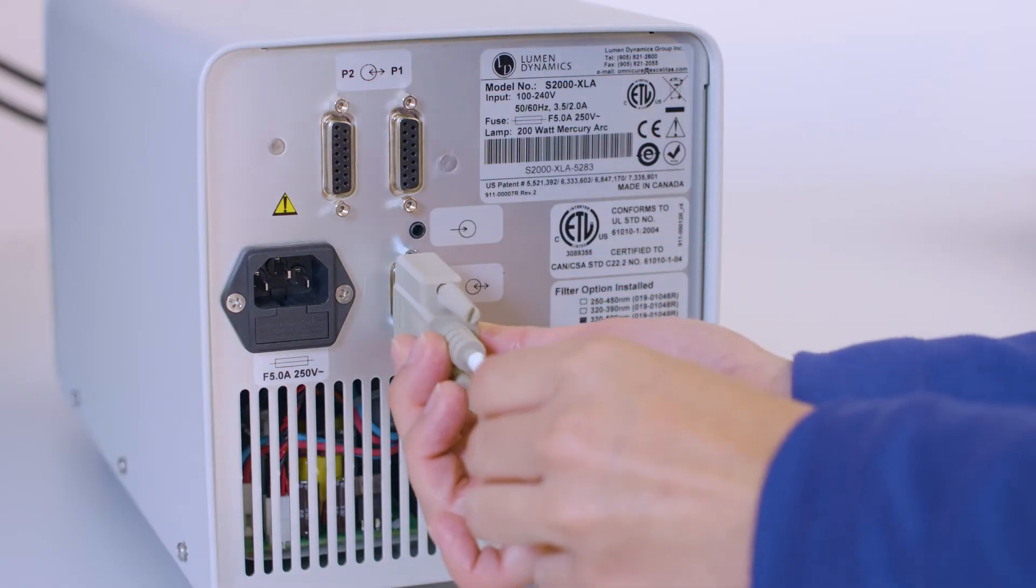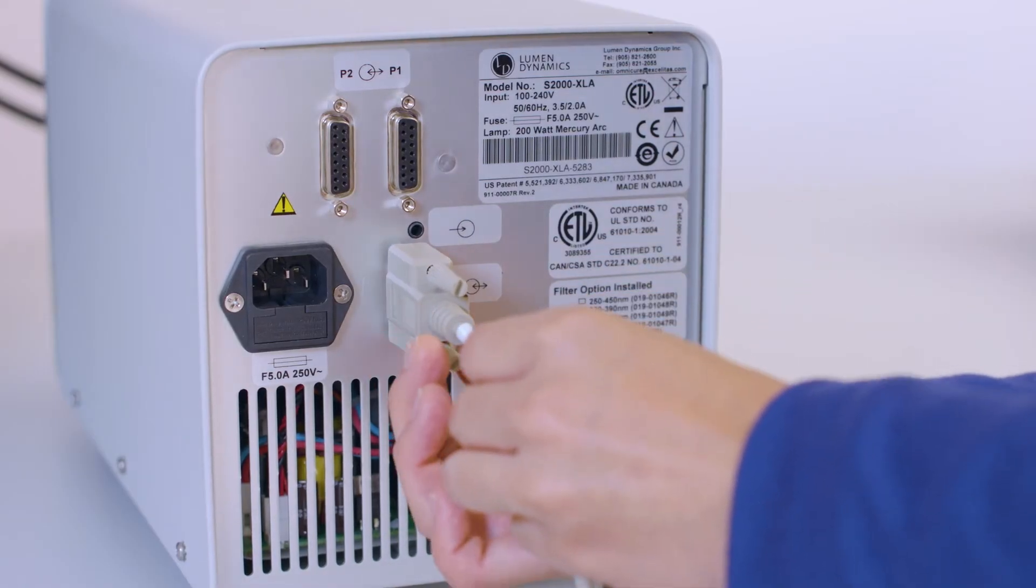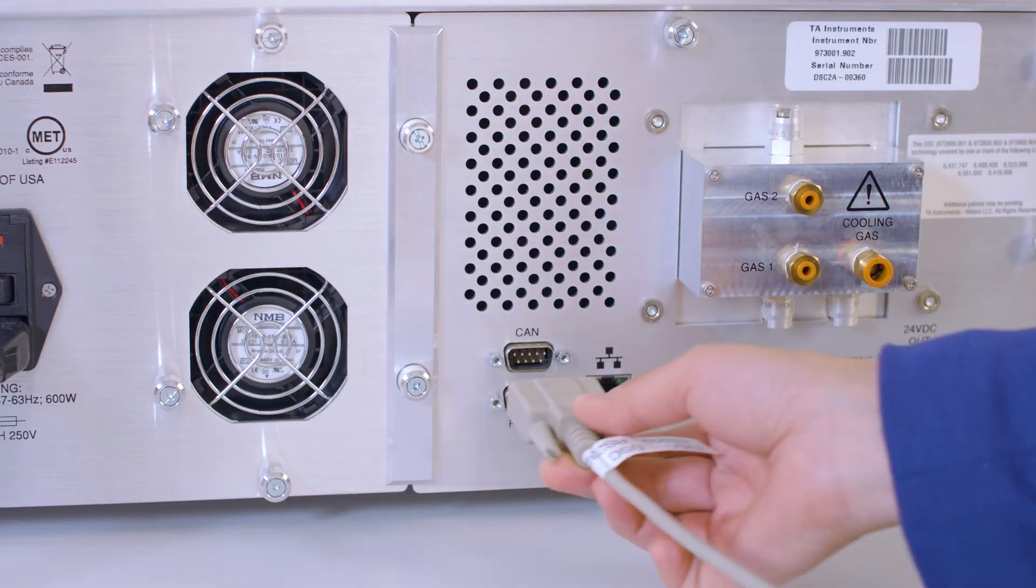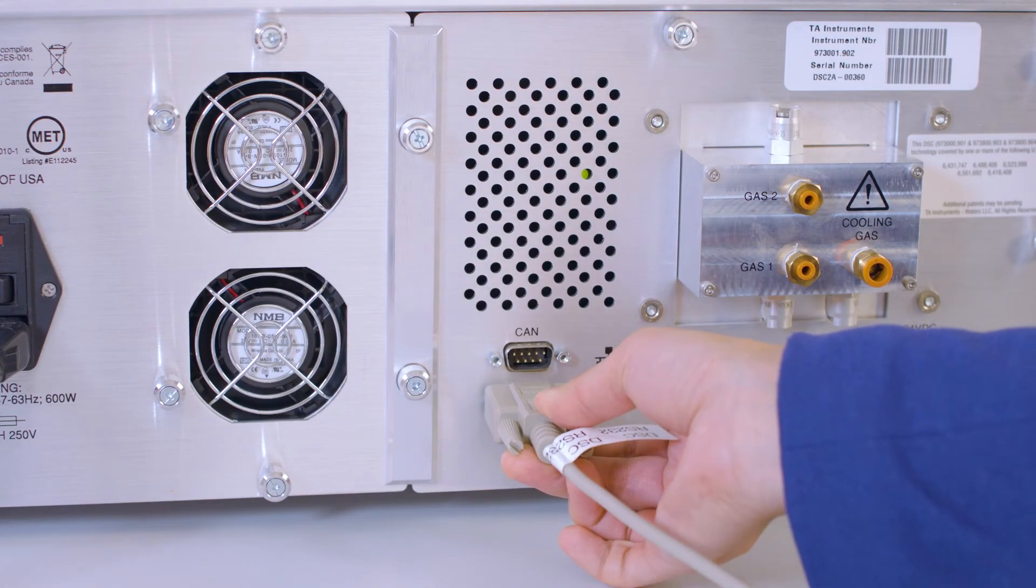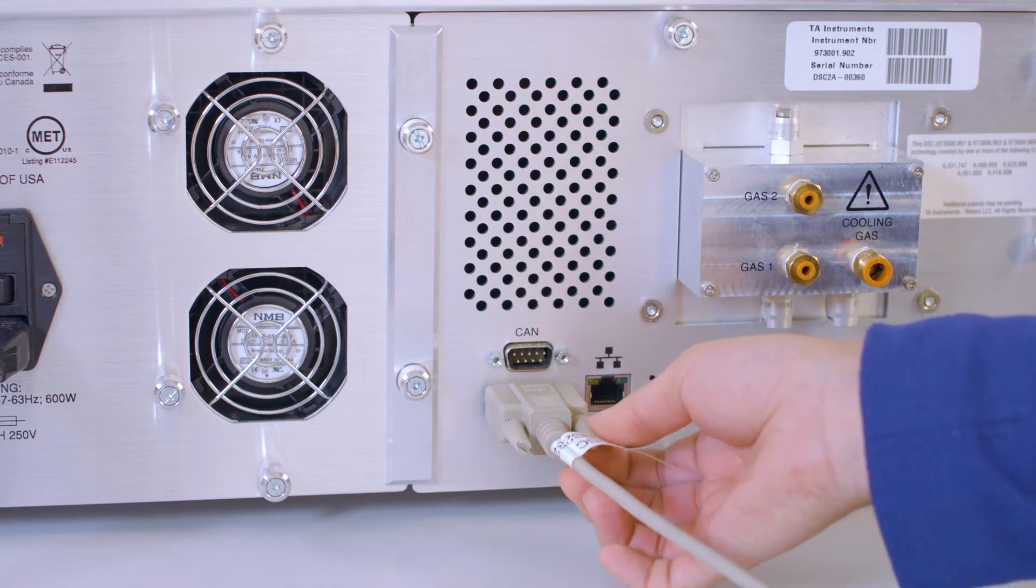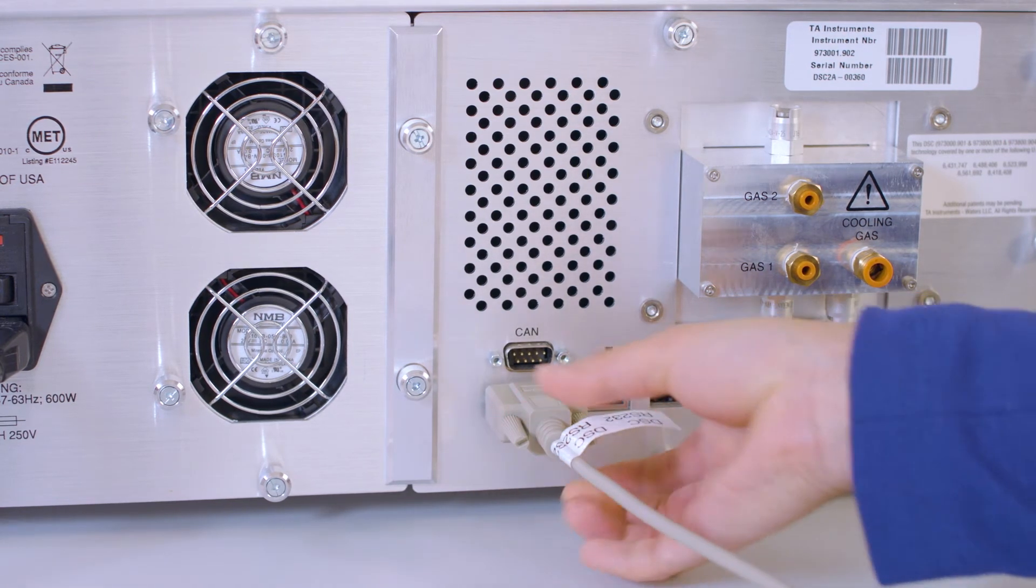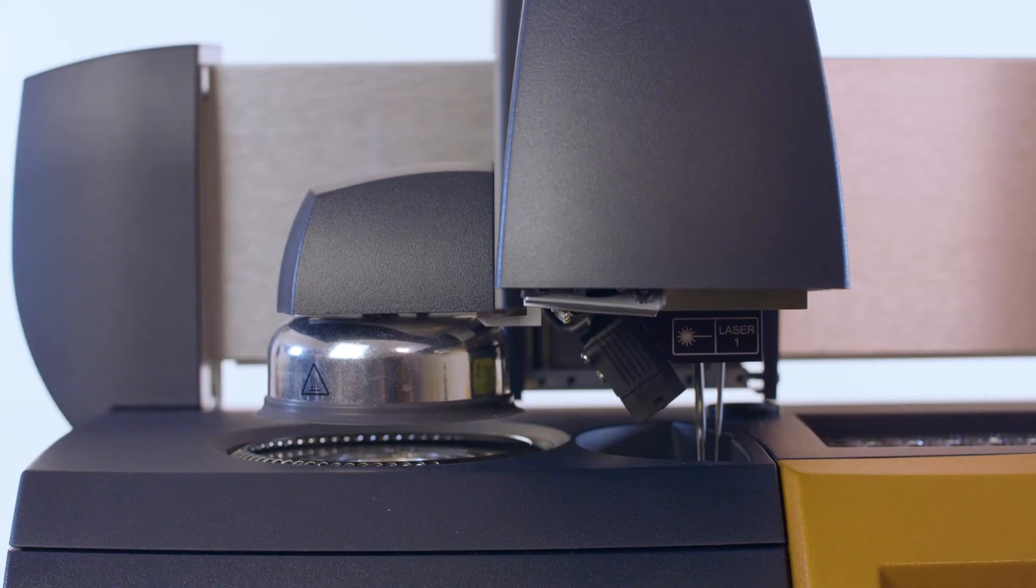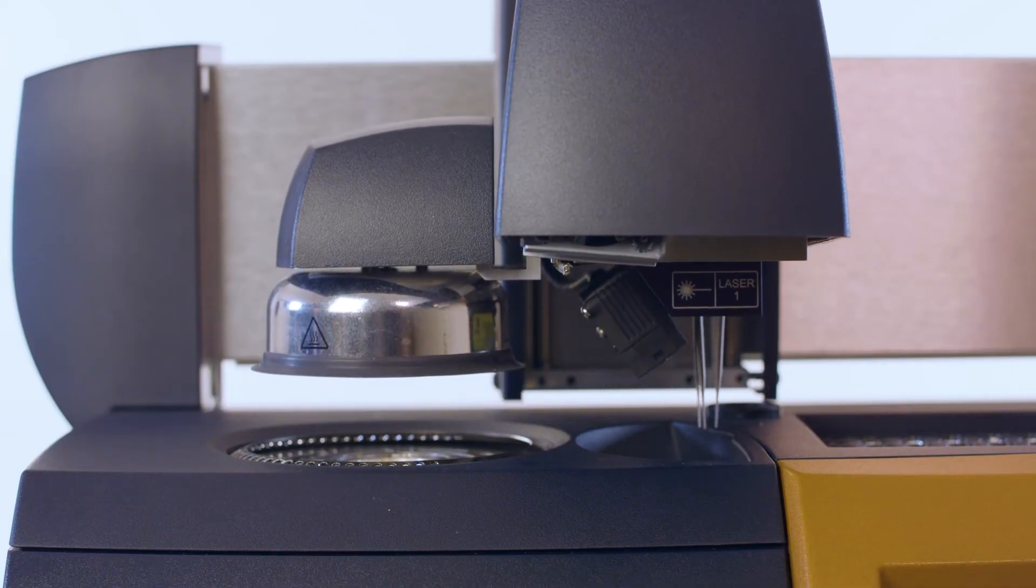Plug the RS-232 cable into the P3 port on the back of the PCA unit. Connect the other end to the RS-232 port on the back of the instrument. This allows the PCA light source shutter to be opened and closed using the PCA shutter and PCA exposure segment in the instrument control software.